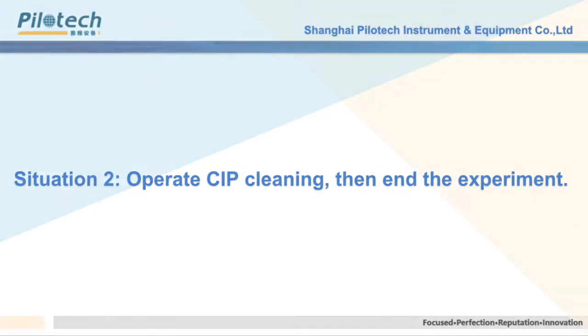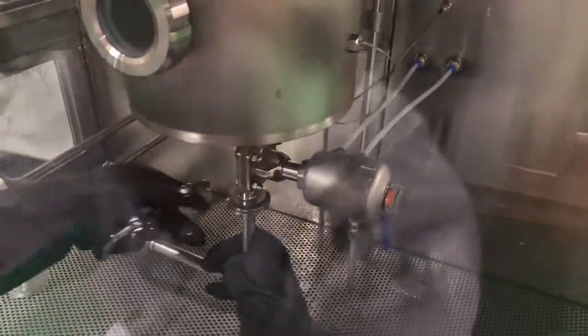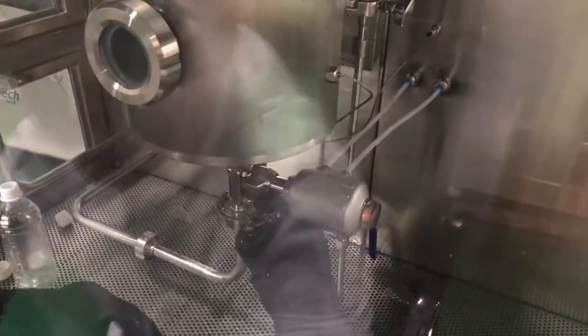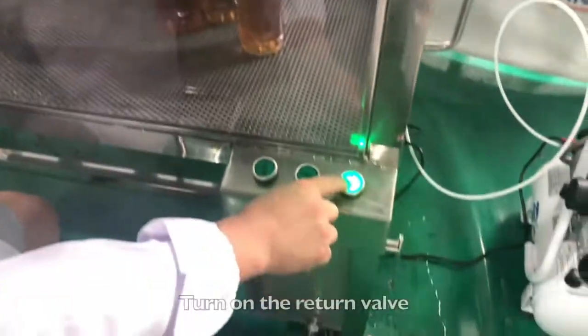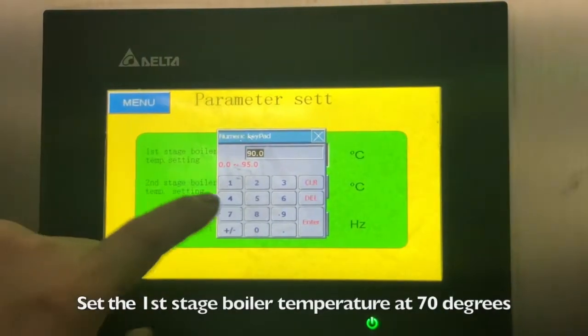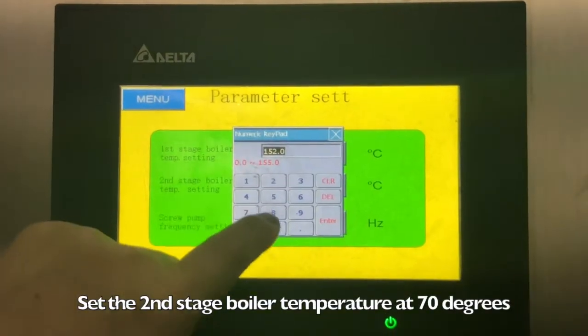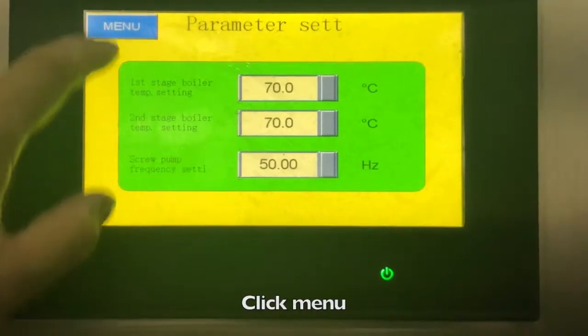Close the water valve. Close the bracing valve. Choose parameters: set the first stage boiler temperature to 70 degrees and the second stage boiler temperature to 70 degrees. Set the screw pump frequency to 50 Hz. Click Menu and choose manual control.